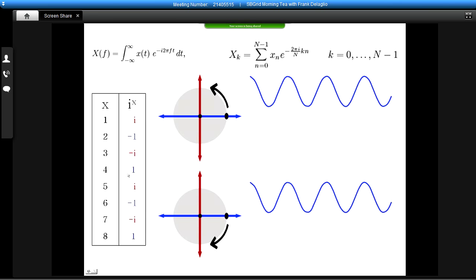So these functions of imaginary numbers will naturally oscillate between real and imaginary values and positive and negative values. So whenever you see functions of imaginary numbers, you should instantly think oscillation. So there's nothing imaginary about them, really. They are quite physical in nature. Why do we use them in NMR?